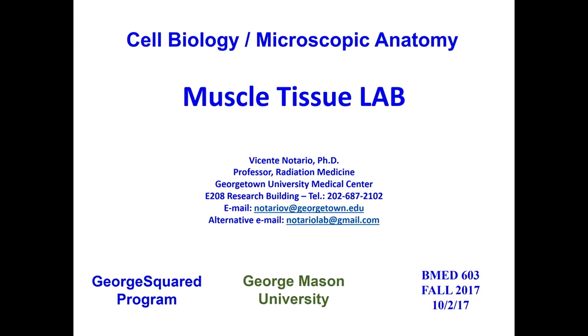Okay. All right, guys. Let's look at slides and see.